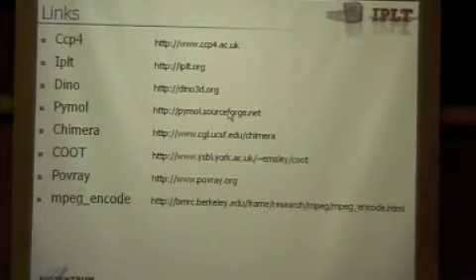Okay, so that's basically the last slide. I just want to give you an overview and also the links where you can find these different tools. As I said before, you can use it for back transformation. And the whole bunch here is basically used for the iso-contouring. But also, I know from Dino you can export it so that you can afterwards use it in PyMOL to do ray tracing.